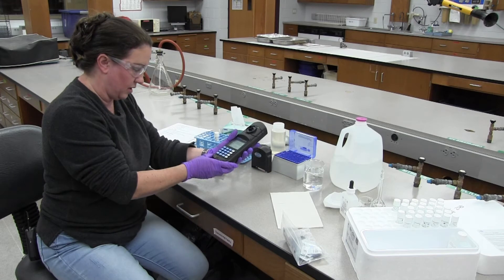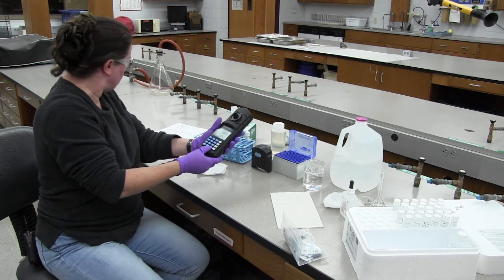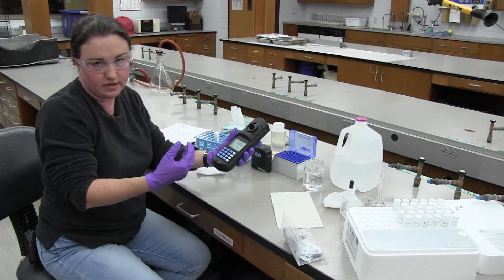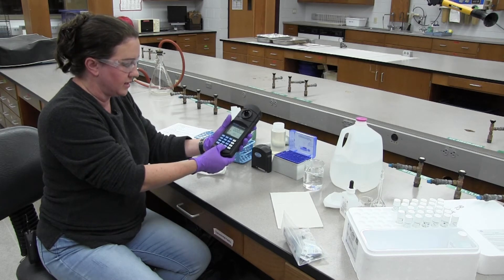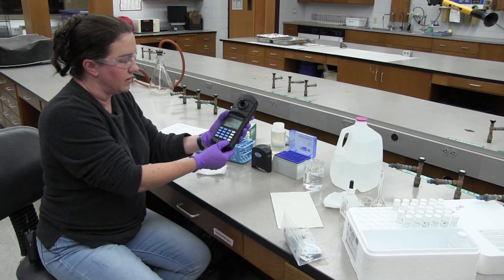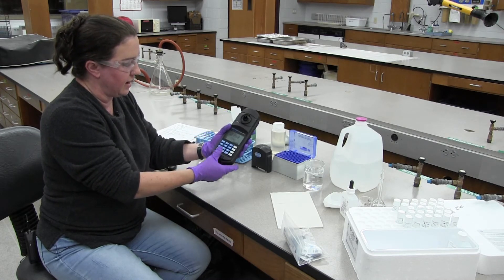Now we're going to shake this for about 15 seconds. Then we're going to set a timer for the wait time because this is going to need time to react with whatever you're reading. I'm going to press timer — it automatically brings up a two-minute timer for the phosphate test — then press enter and it will count down.